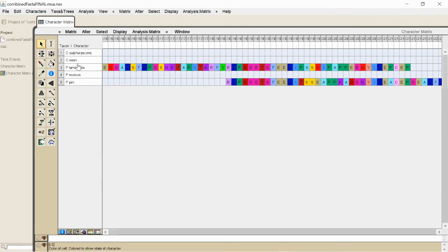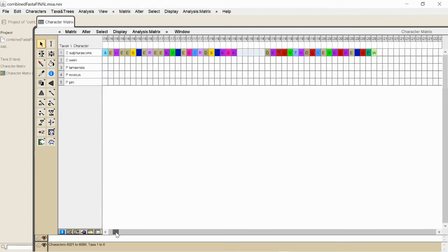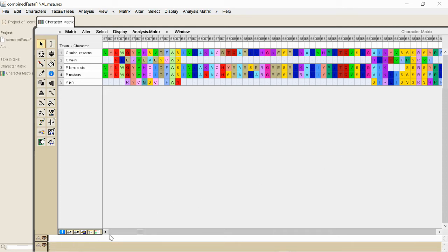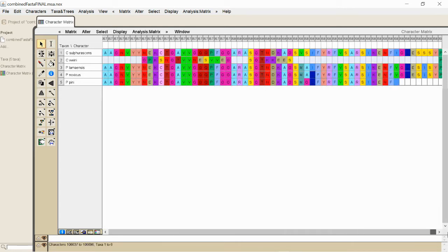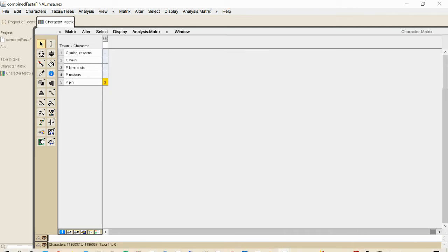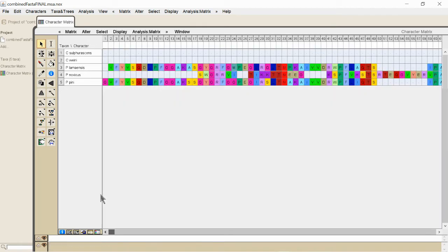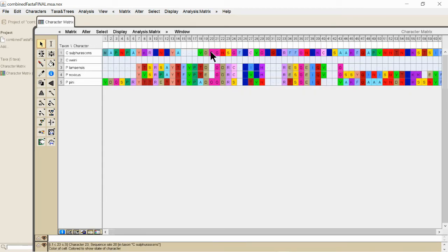And here's our five different taxon over here. And so you can see here at the bottom, this is a total of, let's see how many positions it is. So 1,185,000 positions, and these are amino acids, so this is 3 million positions.